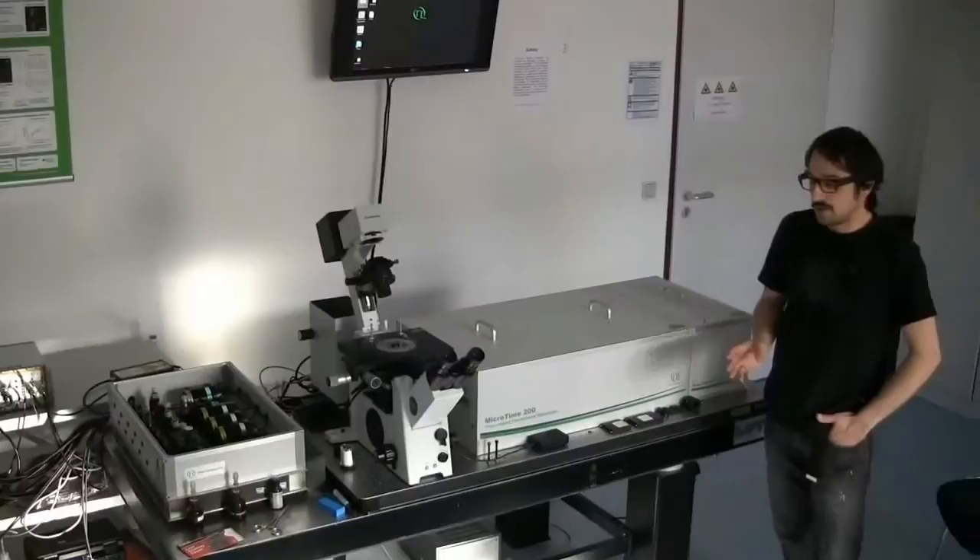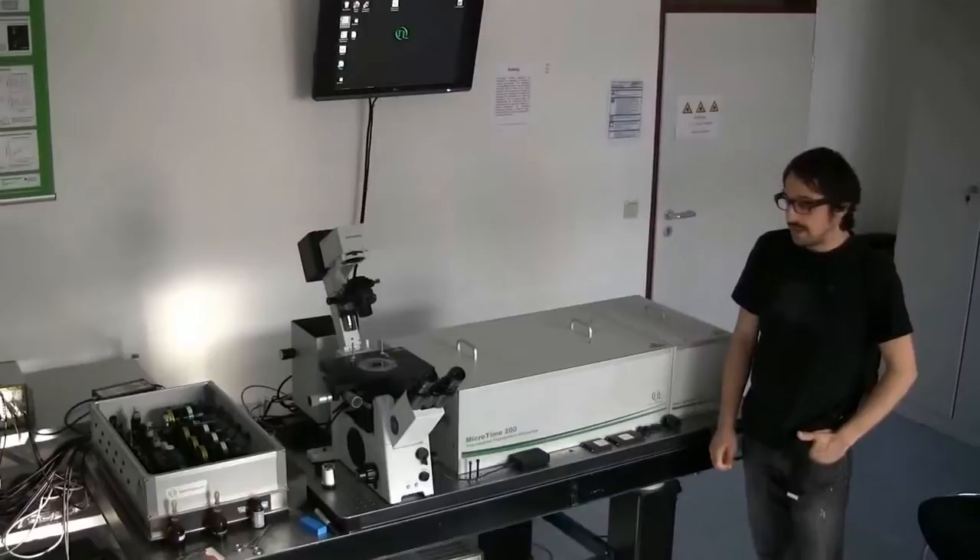Hello, how are you? This is the MICROTIM 200, a single molecule dedicated system for fluorescence measurements.